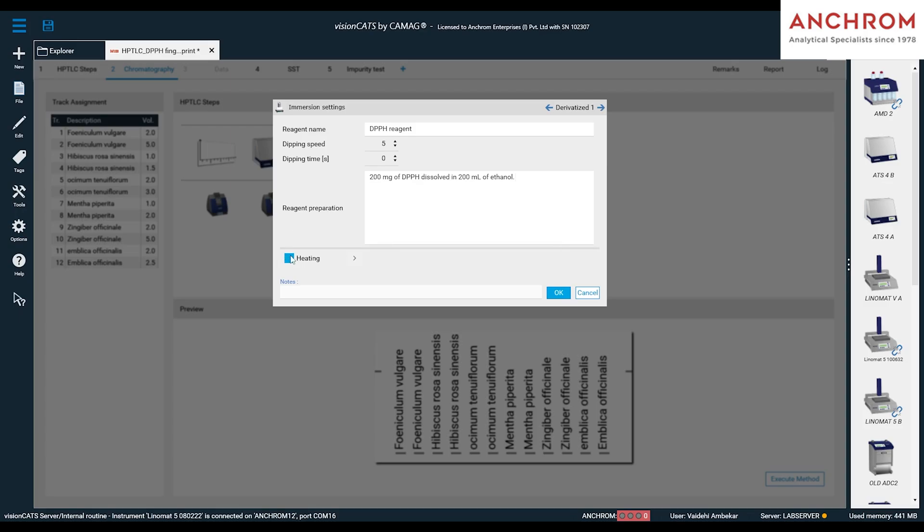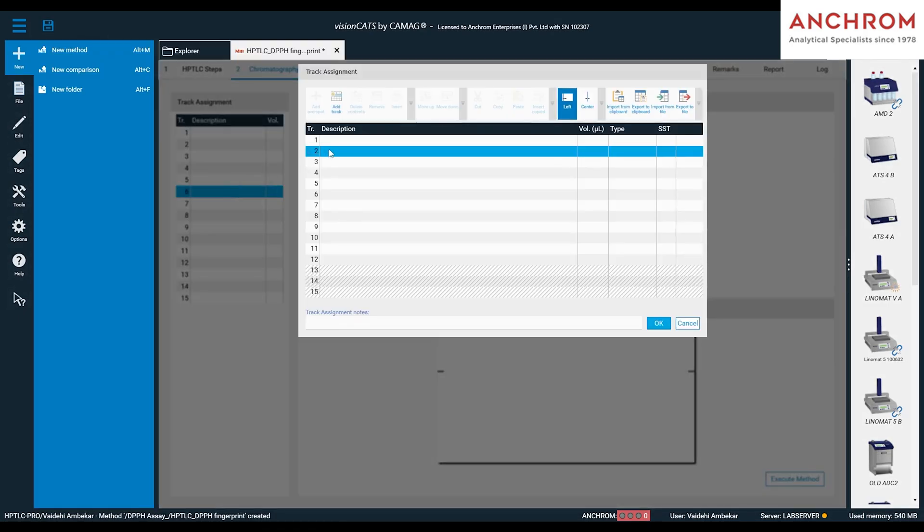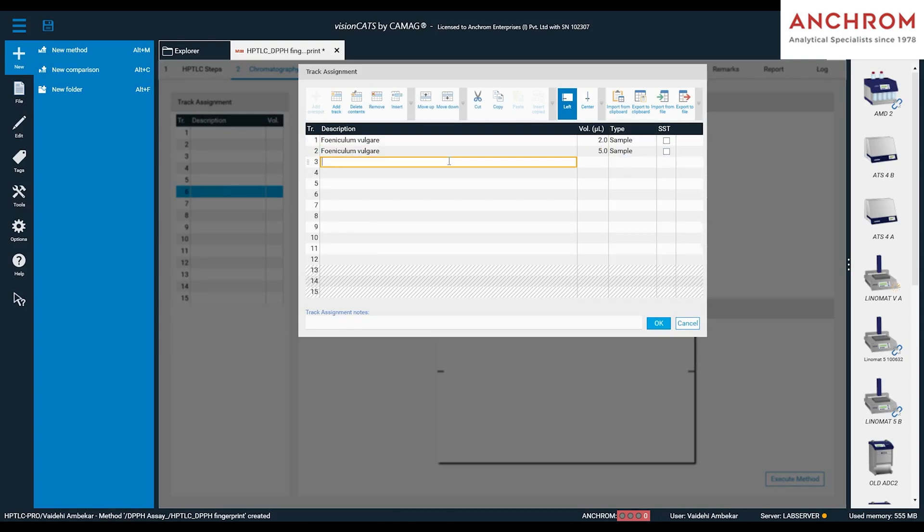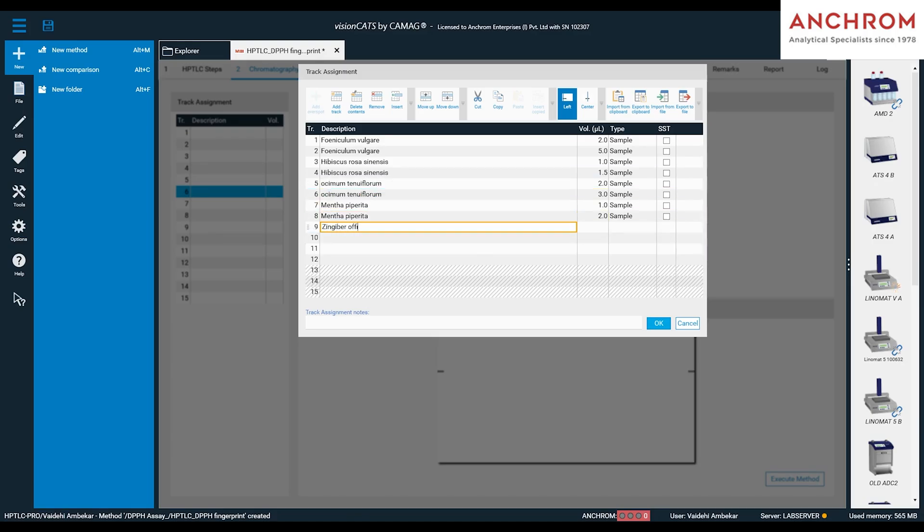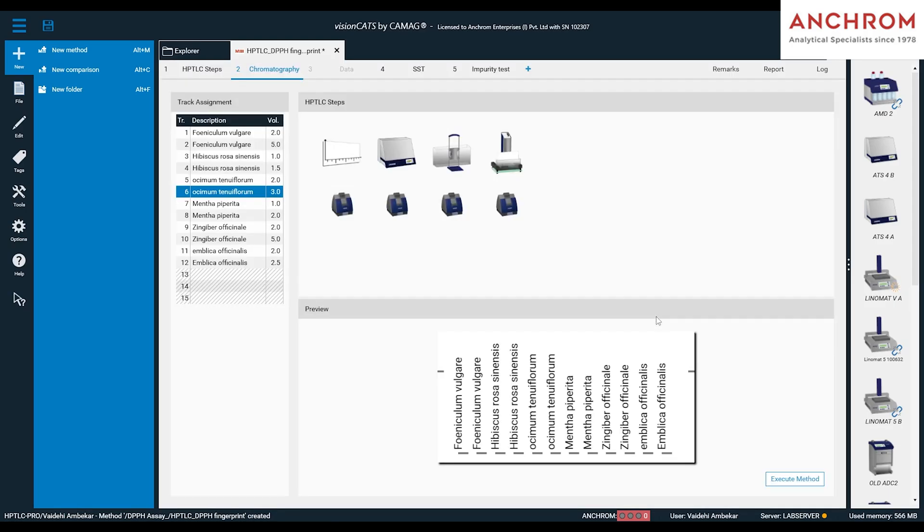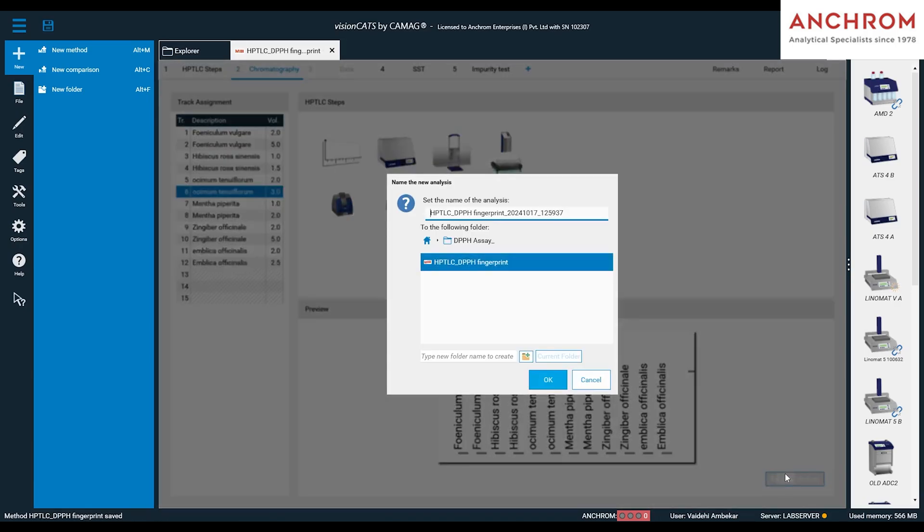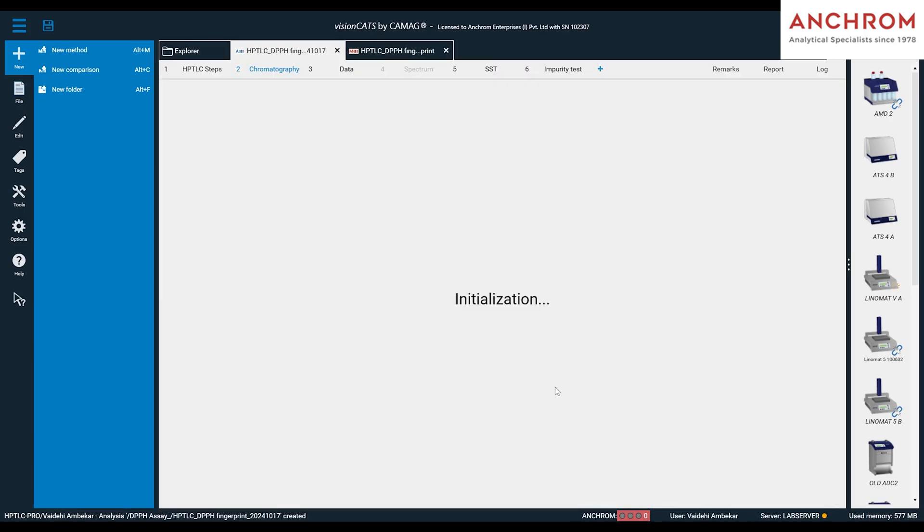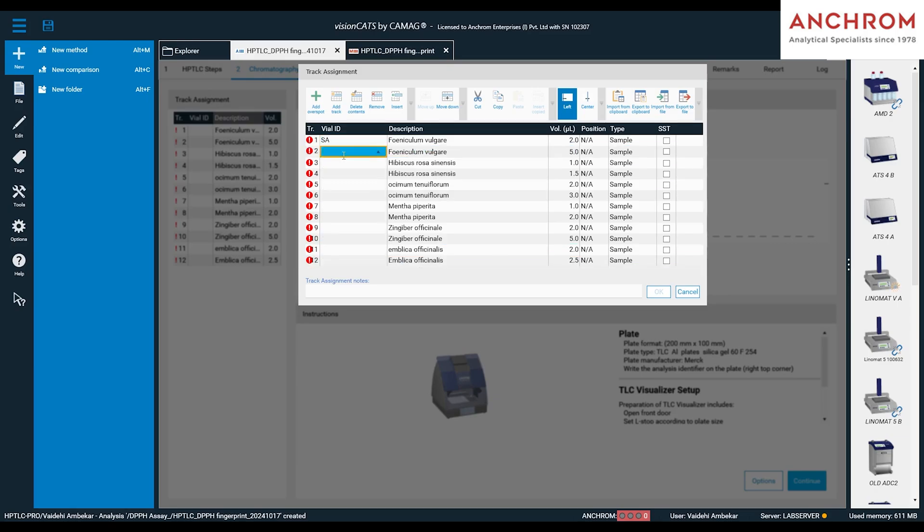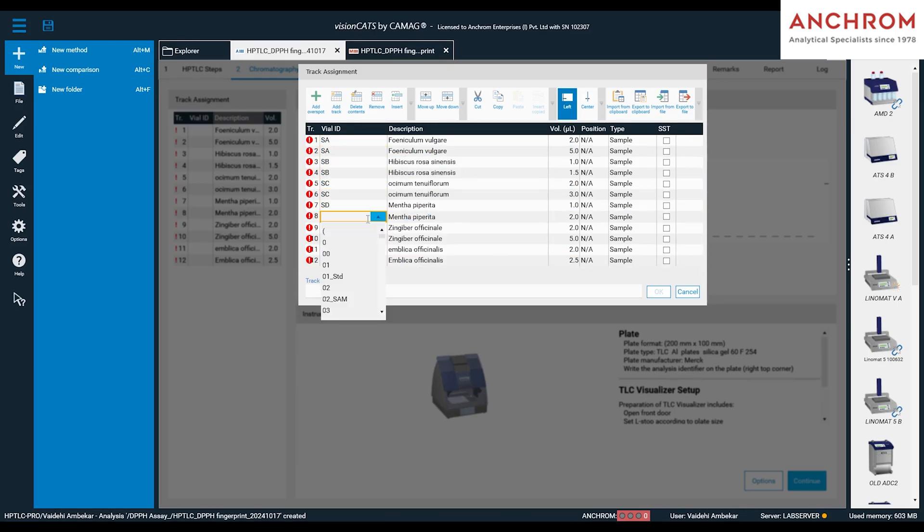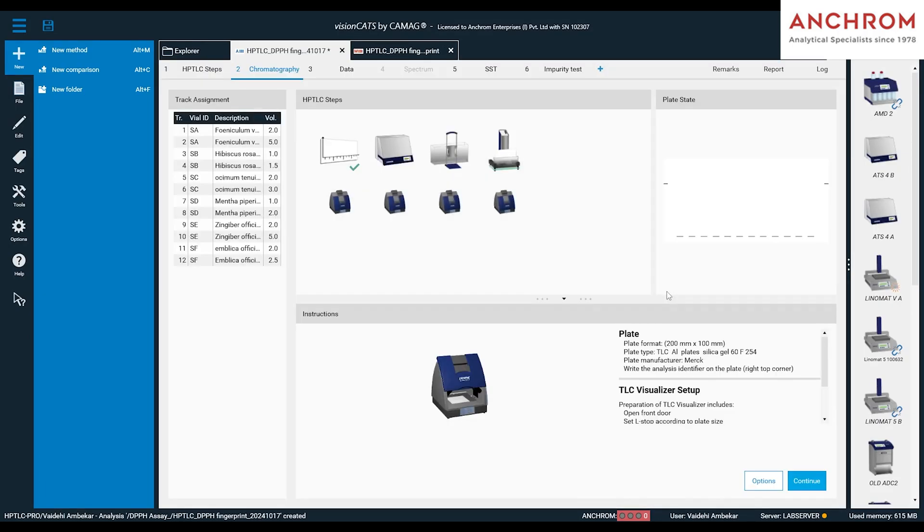After filling all the parameters to the modules, double click on the track assignment to enter the sample details, sample volume, and click OK. The analysis file is now created. In the analysis file, again click on track assignment, fill in the VLID for each of the samples as shown, and then click OK. Once all the parameters in the analysis file are filled in, we will execute the analysis.